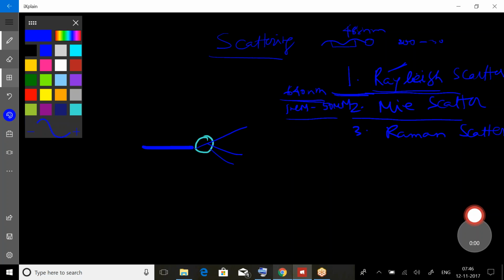In common instruments that is the 640 nanometer laser; the far red 700 plus laser is not that frequently used on the flow cytometer. So the maximum is 640 nanometer versus a 1 micrometer particle or higher. This is the region where the Mie scatter is more active.